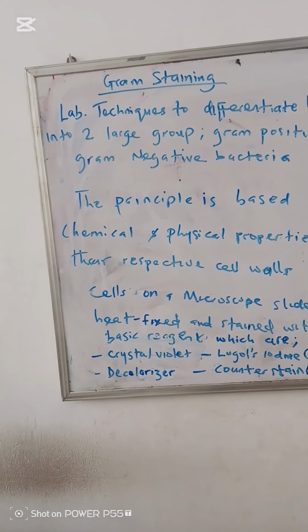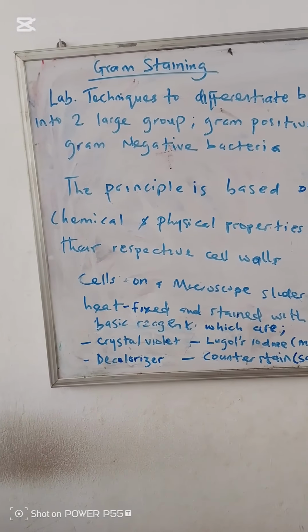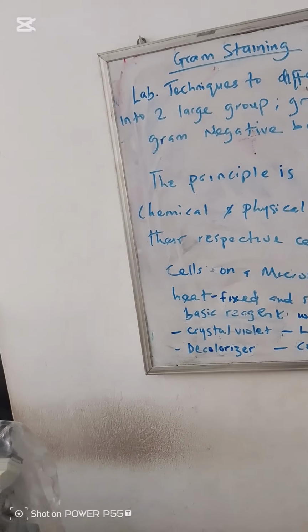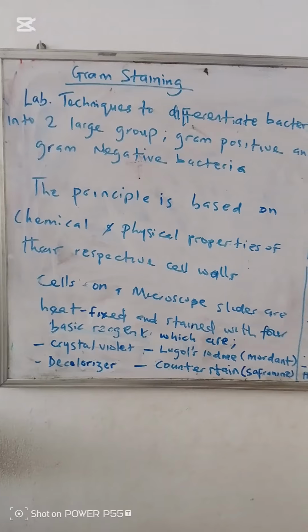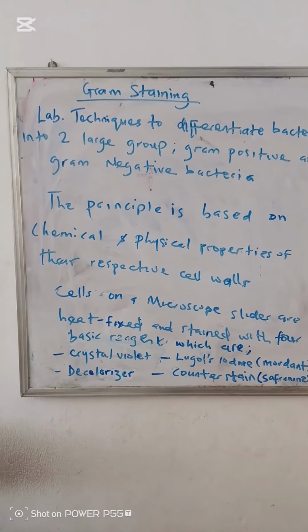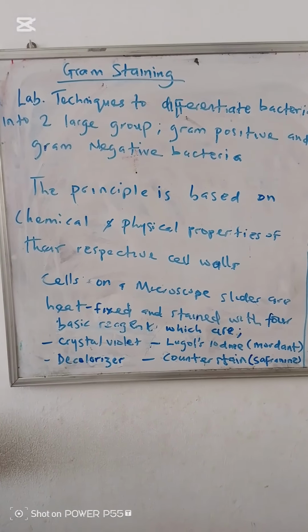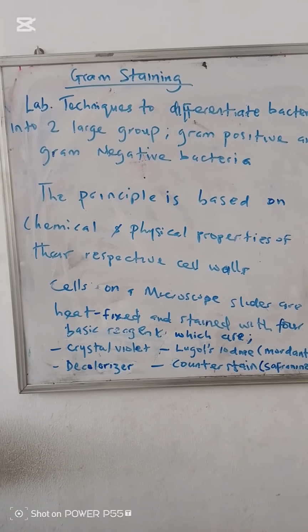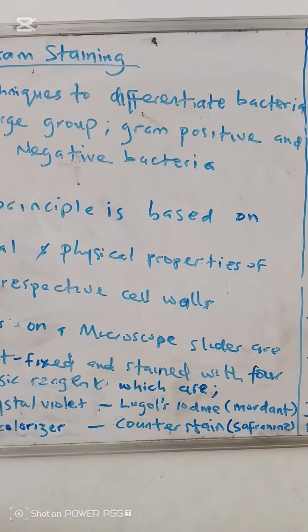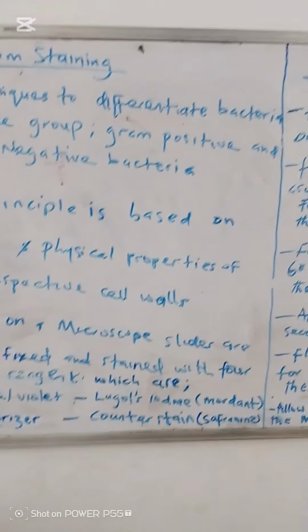The cells on the microscope slides are fixed, and then stained with four basic reagents, which are crystal violet or sometimes gentian violet, which is the primary stain, Lugol's iodine, which is a mordant, decolorizer or alcohol, and the counterstain, or Safranin.